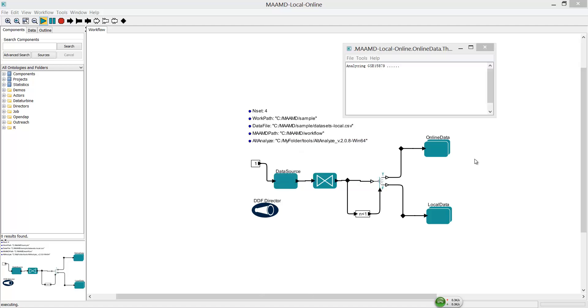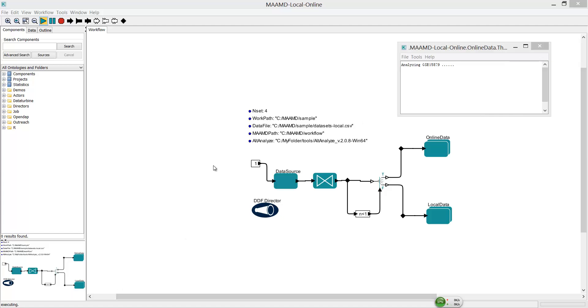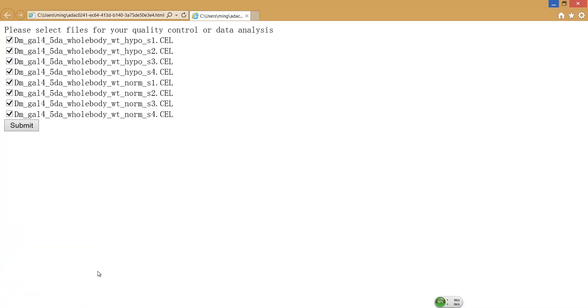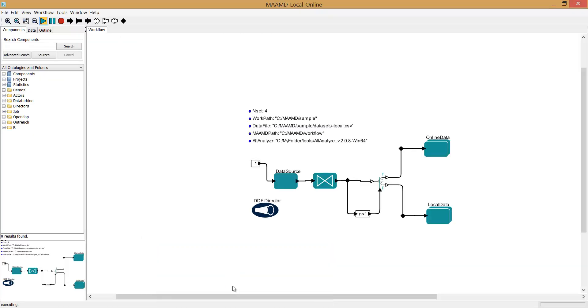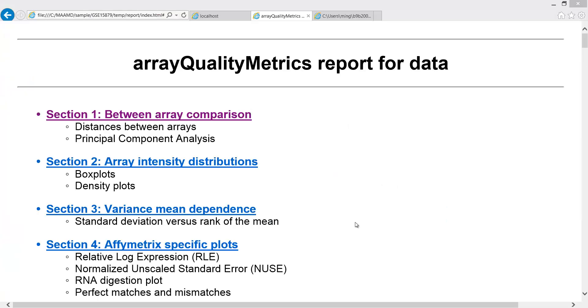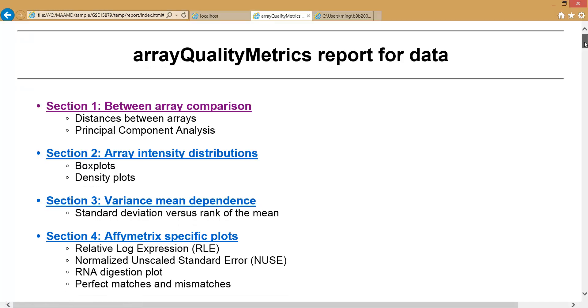The first step of the analysis is the quality control of samples. You select samples for quality control. MAMD will take a while to do the quality estimation for your selected samples. A report will come after the quality control is finished.